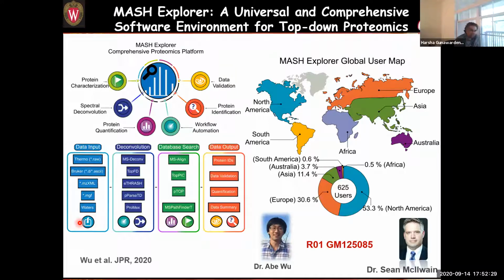I have a question regarding the differences in the algorithms, because in pharmaceuticals, we are evaluating various algorithms to deconvolute our antibodies and our therapeutics, right? And we get varying answers based on the type of deconvolution you do.